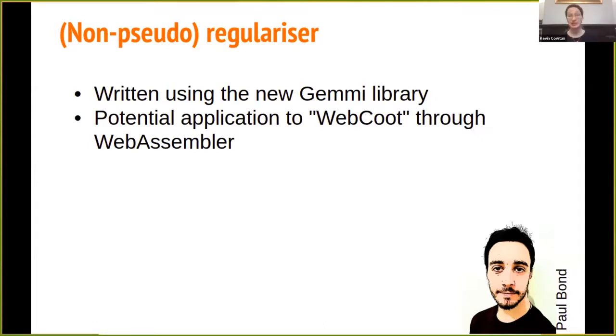is demonstrate that it can be compiled to WebAssembly, and therefore it will run in a web browser. And this is potentially one of the building blocks to build a future web Coot that will run in the web browser and can thus facilitate CCP4 Cloud.